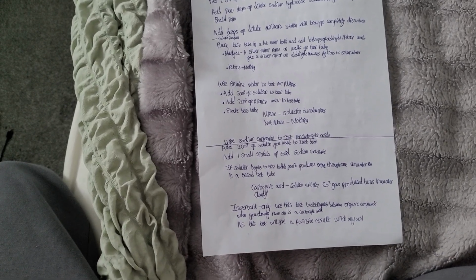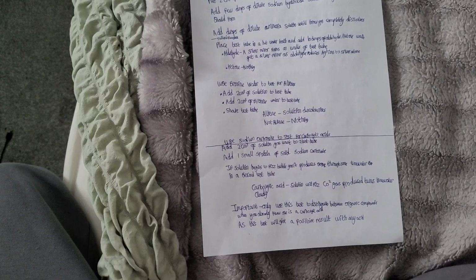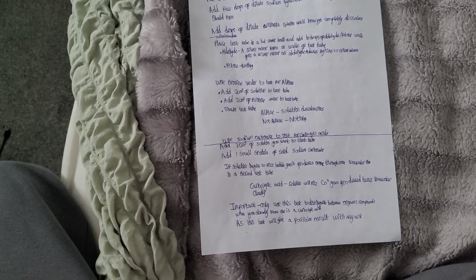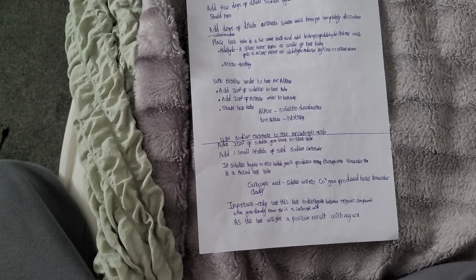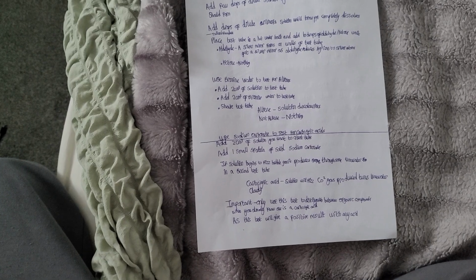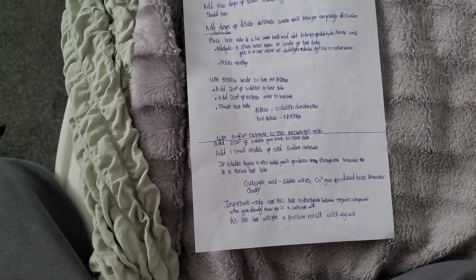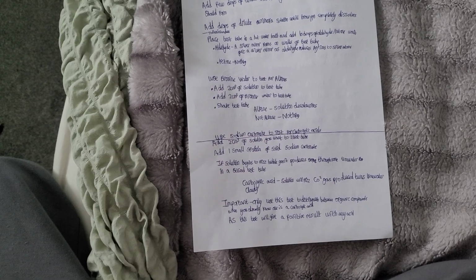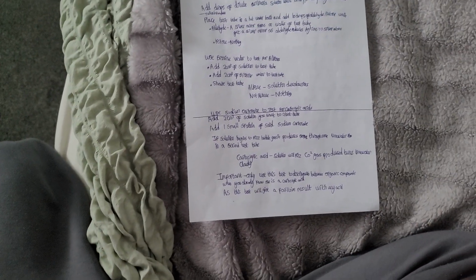And then also use sodium carbonate to test for carboxylic acids. Add 2 cm³ of the solution you want to test to a test tube. Add one small spatula of solid sodium carbonate. If the solution begins to fizz, bubble the gas it produces through some lime water in a second test tube. If it's a carboxylic acid, the solution will fizz, and the carbon dioxide gas produced turns lime water cloudy.